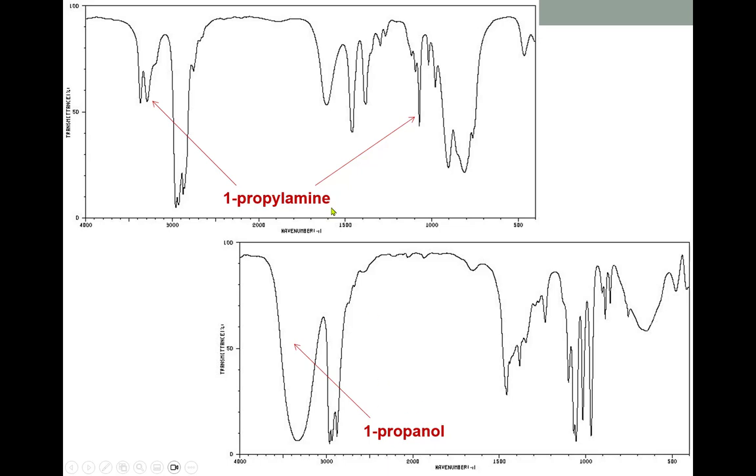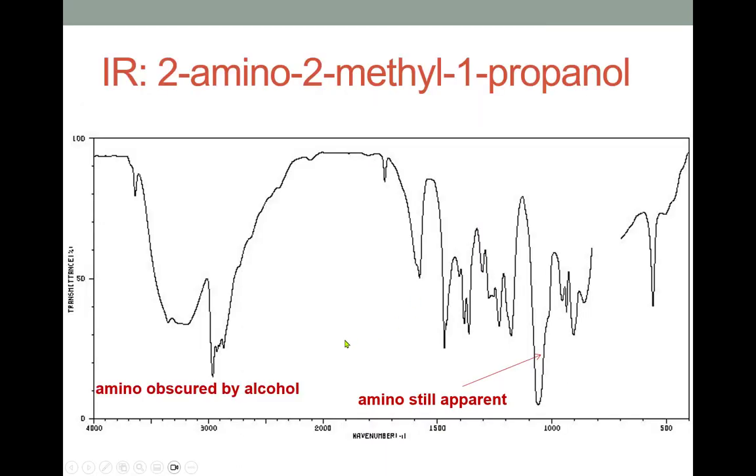So what if I had one molecule that had both an amino group and an alcohol group? Well, what would that look like? Here's an example of one of those. You could draw out this structure, but I have a 3-carbon alcohol that's got a couple of branches on it. When I look at this, what am I seeing? Yes, I see an alcohol group here. That one's pretty easy.